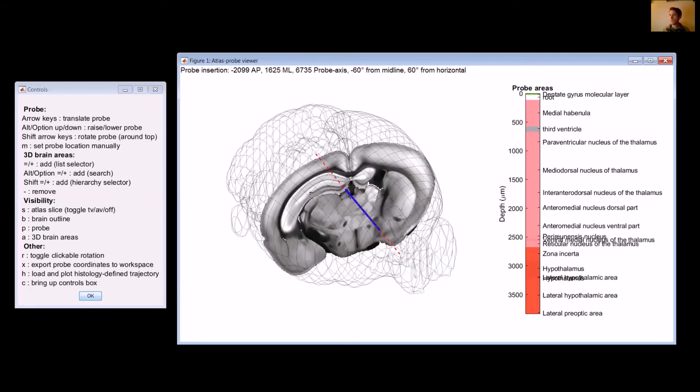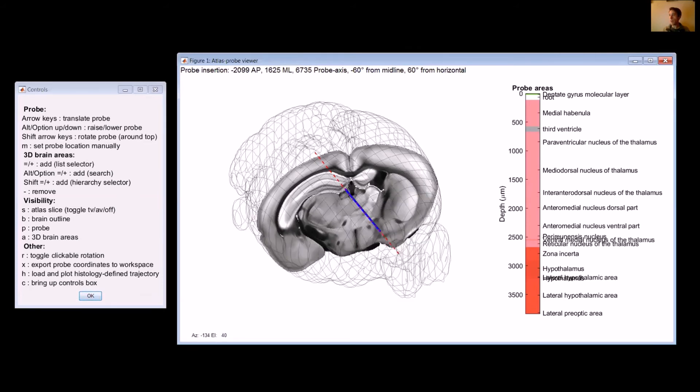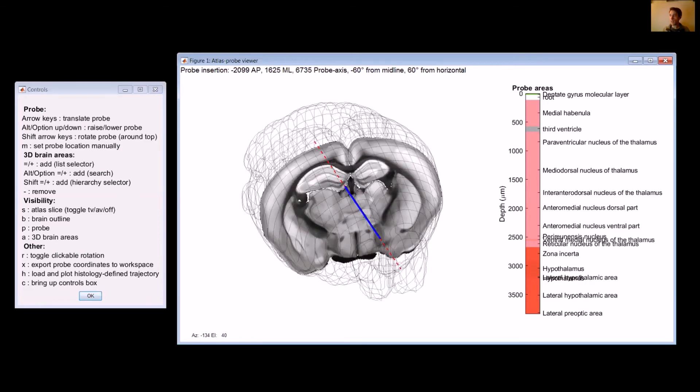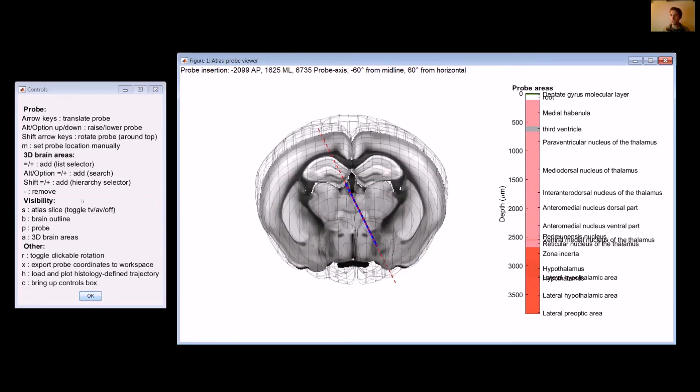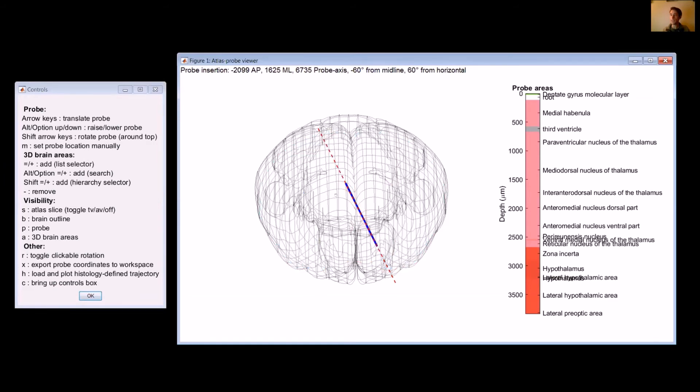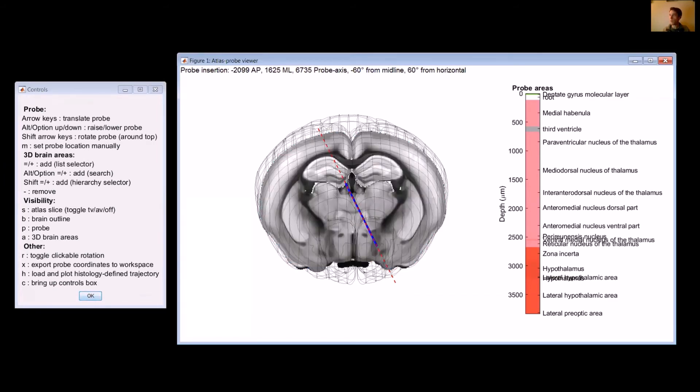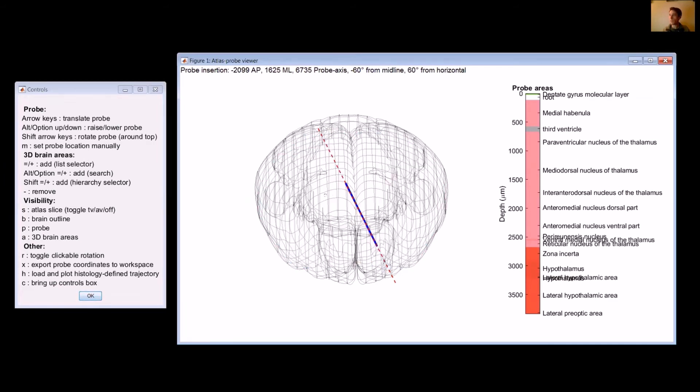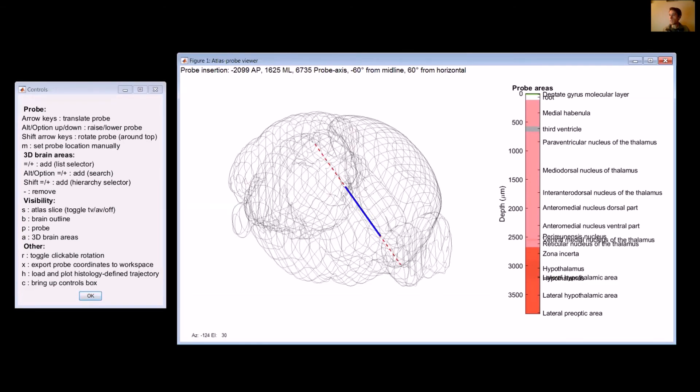That's the general idea of how you move the probe around. Now looking at this slice and adding in 3D brain areas so you can figure out where you want to go. The slice that we're seeing, we can have either be the regular anatomical slice from the CCF, that's the default, and then you can change this by hitting the S key. So at the moment it's this volume version. If you hit S, then it says S stands for slice, then it turns into these different color-coded areas. If you hit S again, then it goes away. So this is volume areas off. So that's how you manipulate the slices.